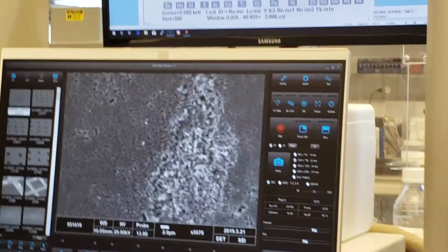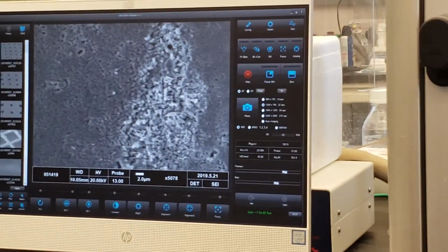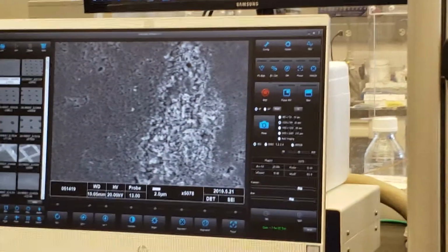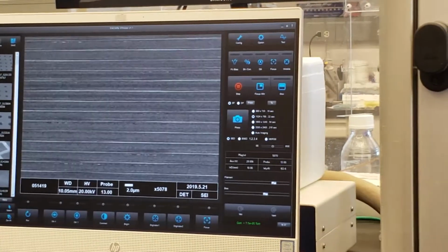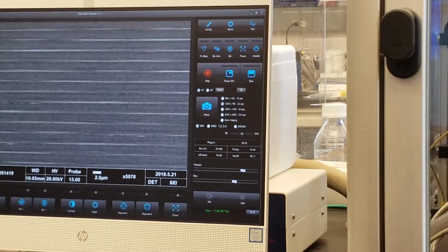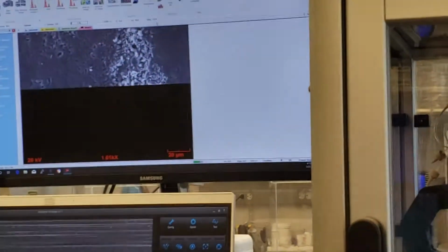All right. So regardless, we acquired a spectra. Great. The next thing in our software is working with digital images. So if I click on this window and go acquire an image, this is going to take control of the microscope, and it's going to start dropping down that exact image that I saw here. My image then gets transferred, and the most important thing about this image is this magnification readout, right? See that? The microscope was at 5000x, so I blew it.